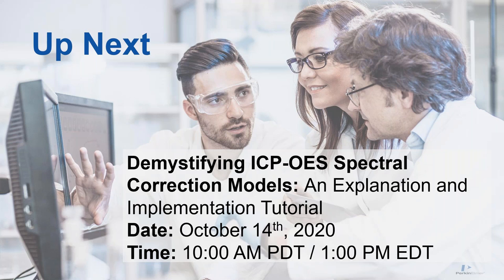We had a question. What are the best parameters for the auxiliary RF and nebulizer when dealing with oil samples to prevent the plasma from extinguishing? It depends on the model of the instrument. Yeah, it depends on the model and the torch, the nebulizer. Usually you want to run them at the highest power of the RF generator, usually like 1500 watts or so.